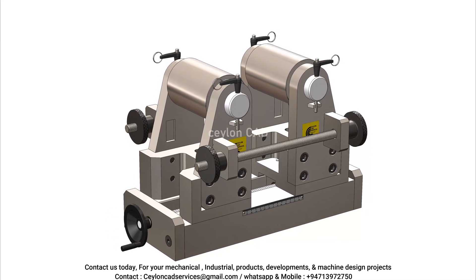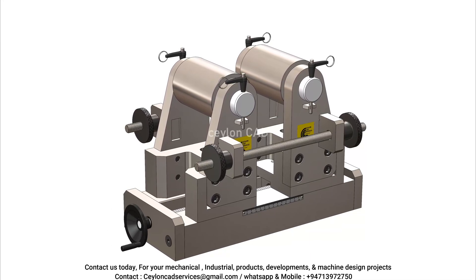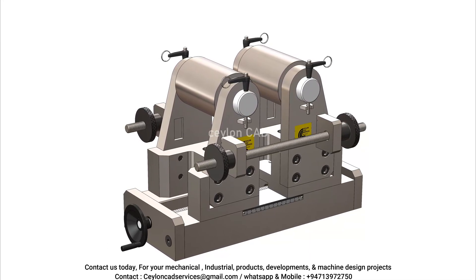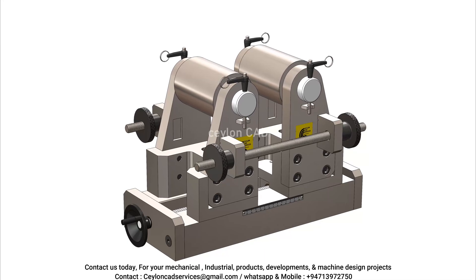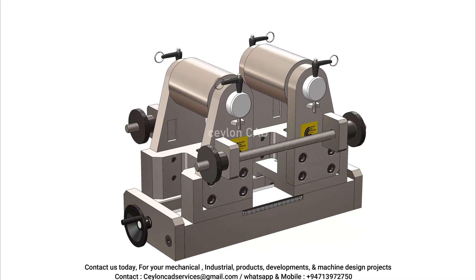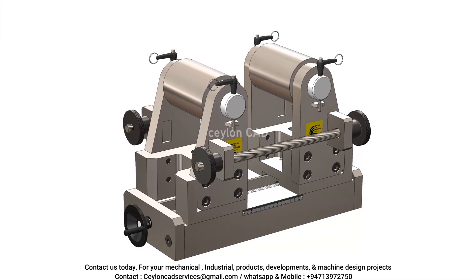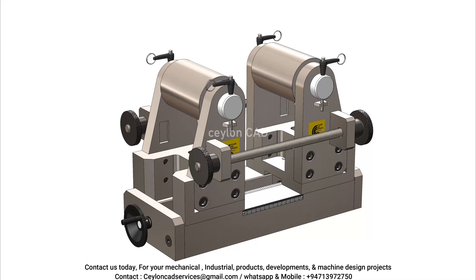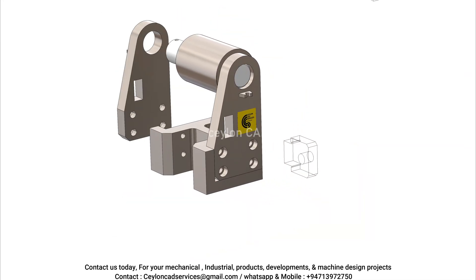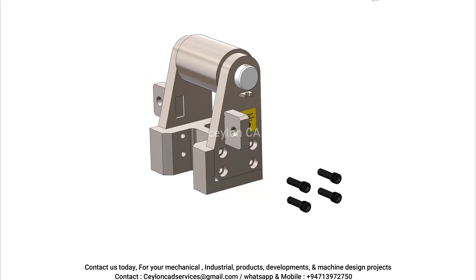Here are the main advantages of our innovative design. Interchangeable sleeves: with our new fixture, all you need to do is change the sleeve for different specimen diameters — there's no need to adjust or replace multiple parts, simplifying the process significantly. Minimal changeover time: the design ensures quick and effortless transitions between sleeve sizes, reducing downtime and increasing productivity.